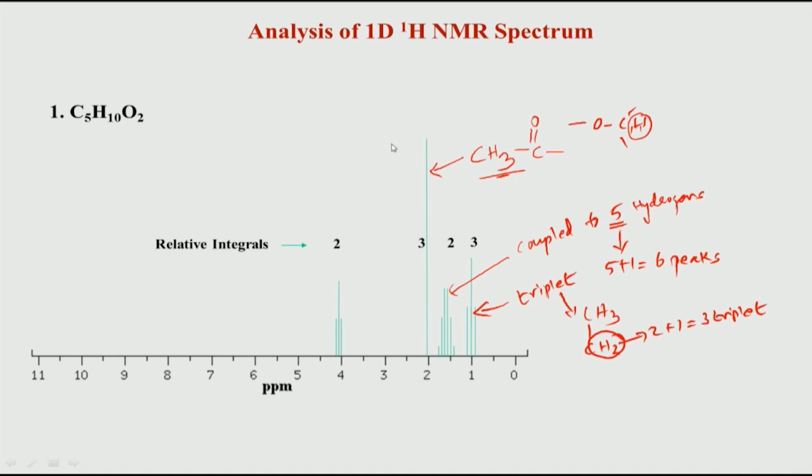So, if you put all these together, the structure which will satisfy this particular molecule is the one shown here. You see we have CH3, CH2, CH2, CO, CH3. There is a slight correction: this C is carbonyl. So, this C is attached to this oxygen, not to this oxygen. So, this has got shifted. Basically it is CH3, COO, CH2, CH2, CH3.